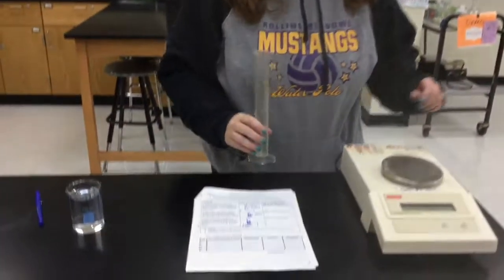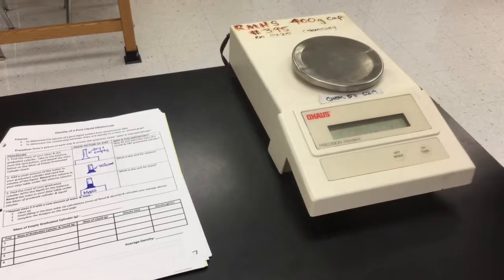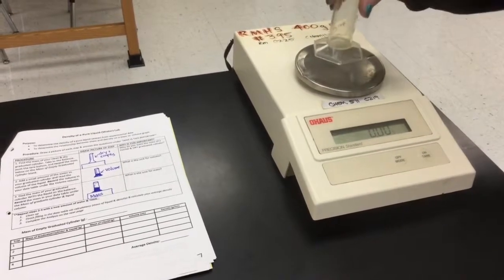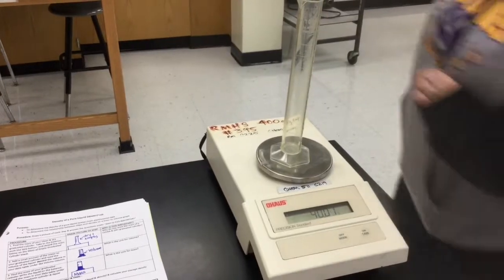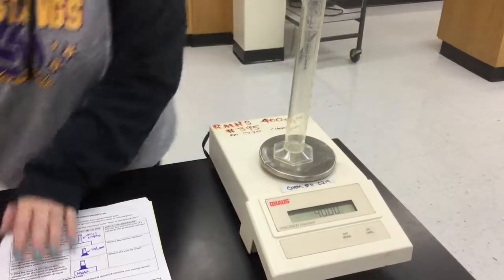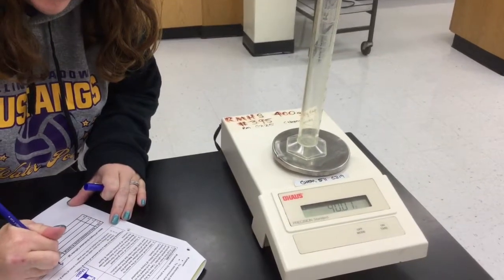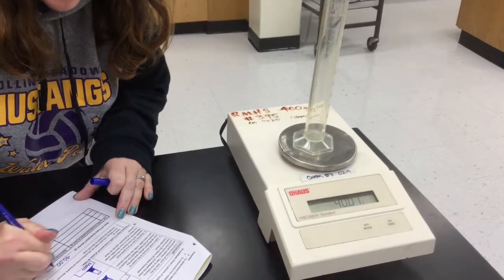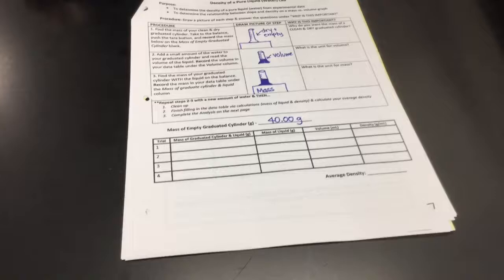Hey! Yeah! All right. So step one, I'm going to tare the balance. Tare the balance, make it go to 0. Okay. And then I'm going to find the mass of my empty graduated cylinder. There we go. 40.00. It fluctuates sometimes, but whatever it ends up landing on, now it's 40.01. But 40.00 should be okay. There's some air moving. Okay, and that's the mass of the empty graduated cylinder.